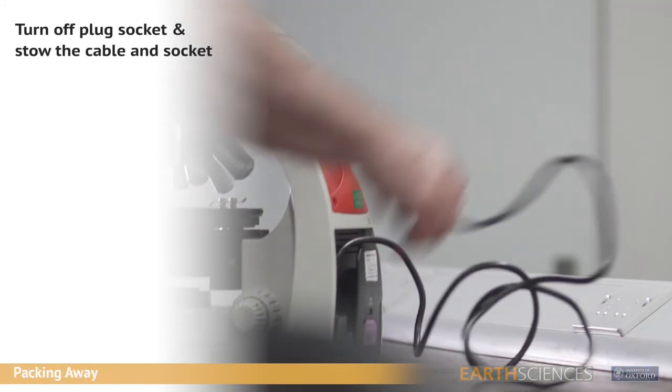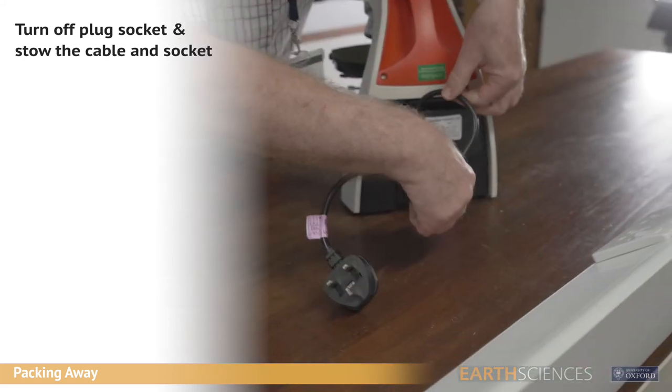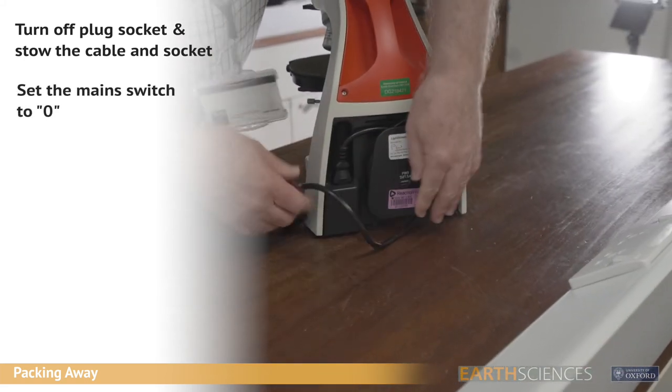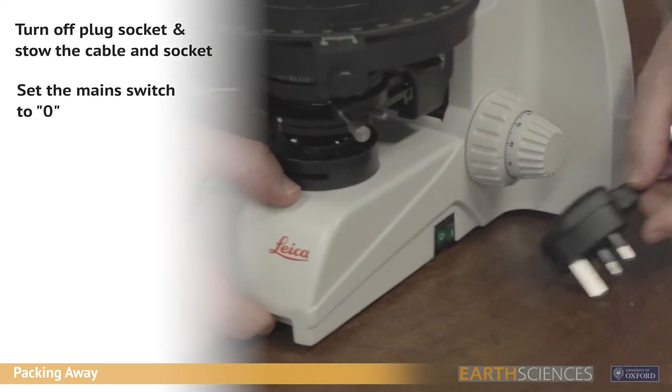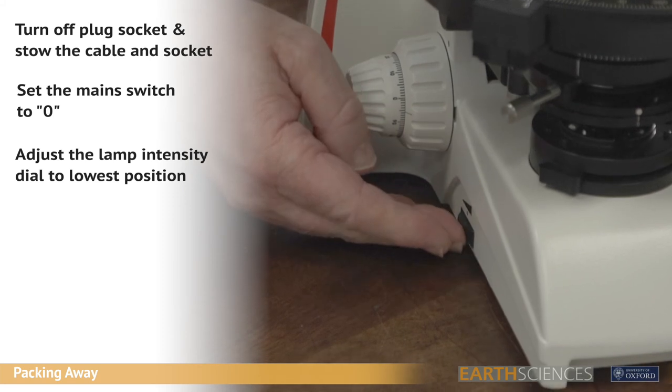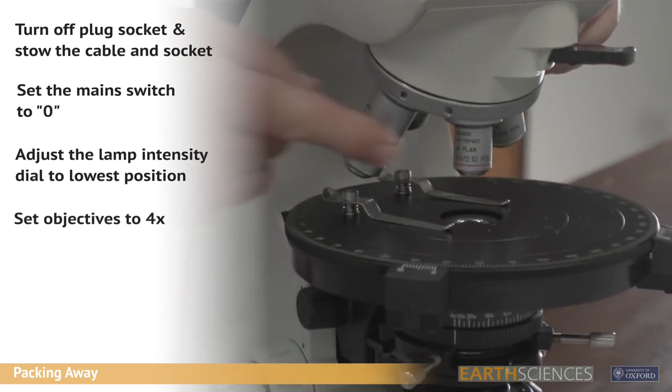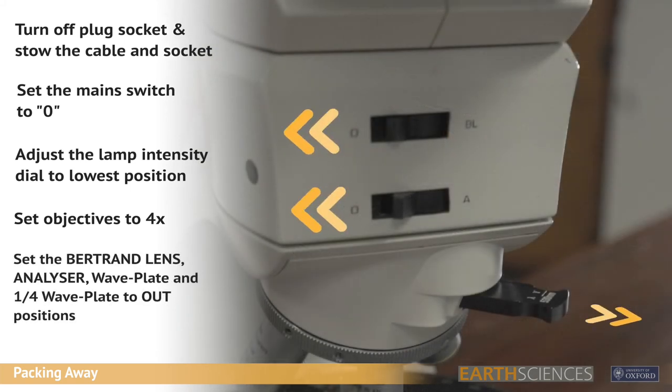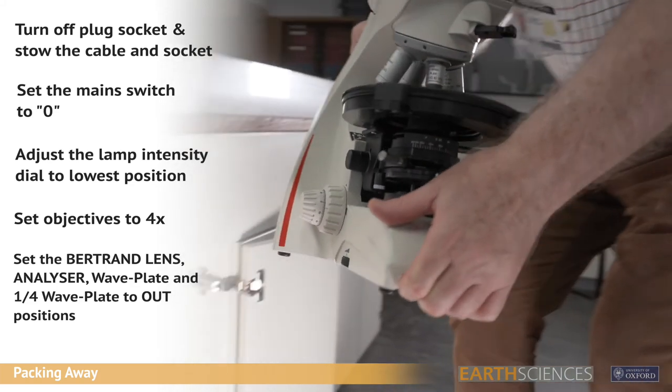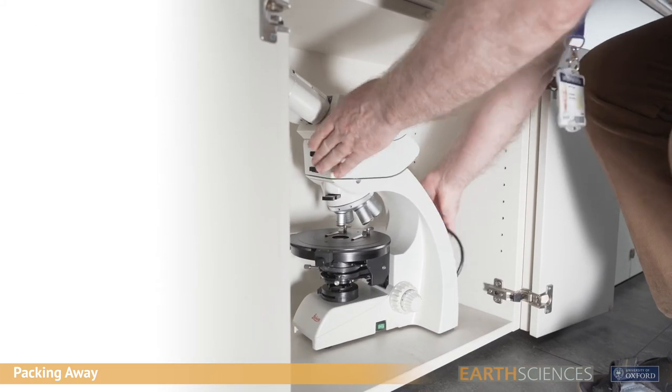When packing away, turn off the plug socket and stow the mains cable and socket in the cable tidy at the rear of the microscope. Set the main switch to zero and adjust the lamp intensity dial to the lowest position. Check that the objectives are set to 4x magnification and that the analyzer, Bertrand lens, wave plate and quarter wave plate are set to the respective out positions. Finally, stow the microscope in its originating cupboard.